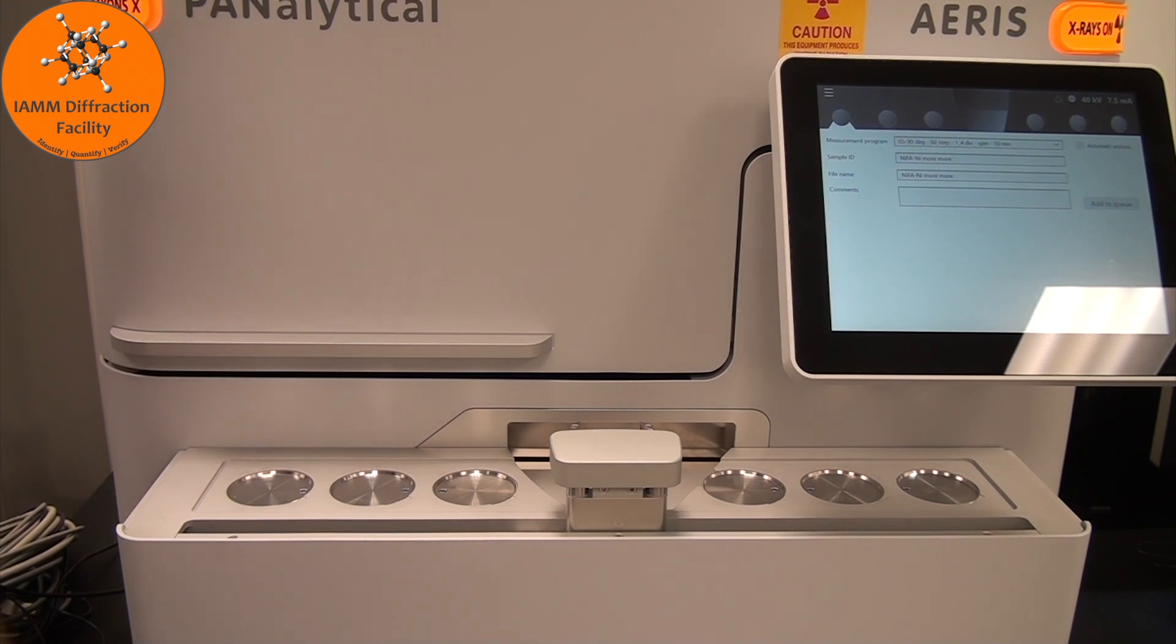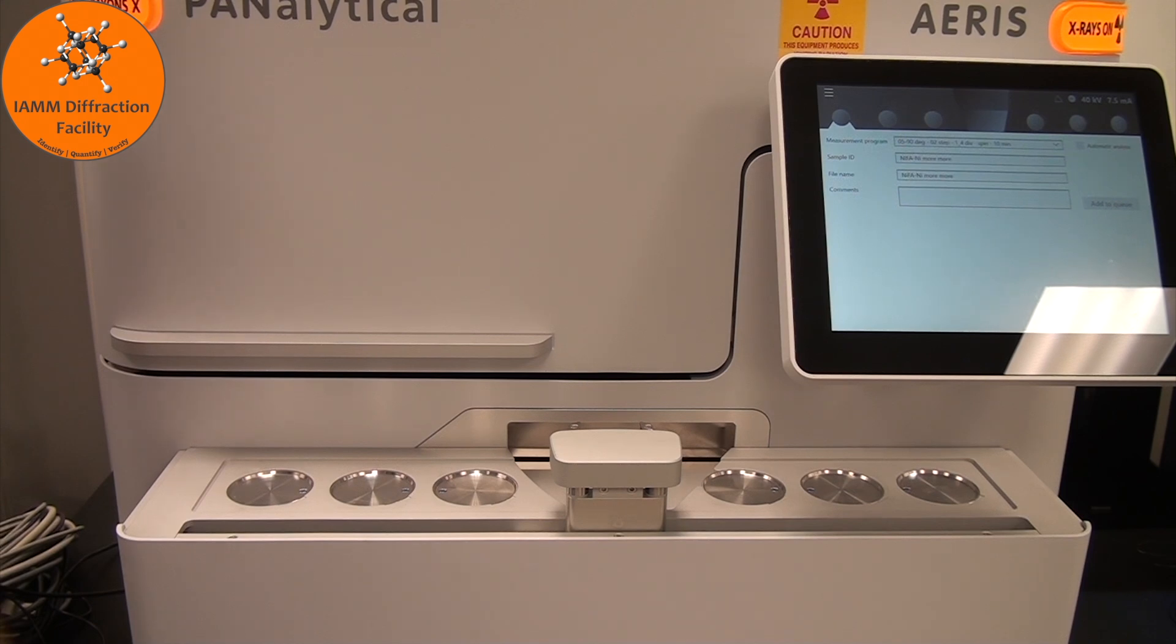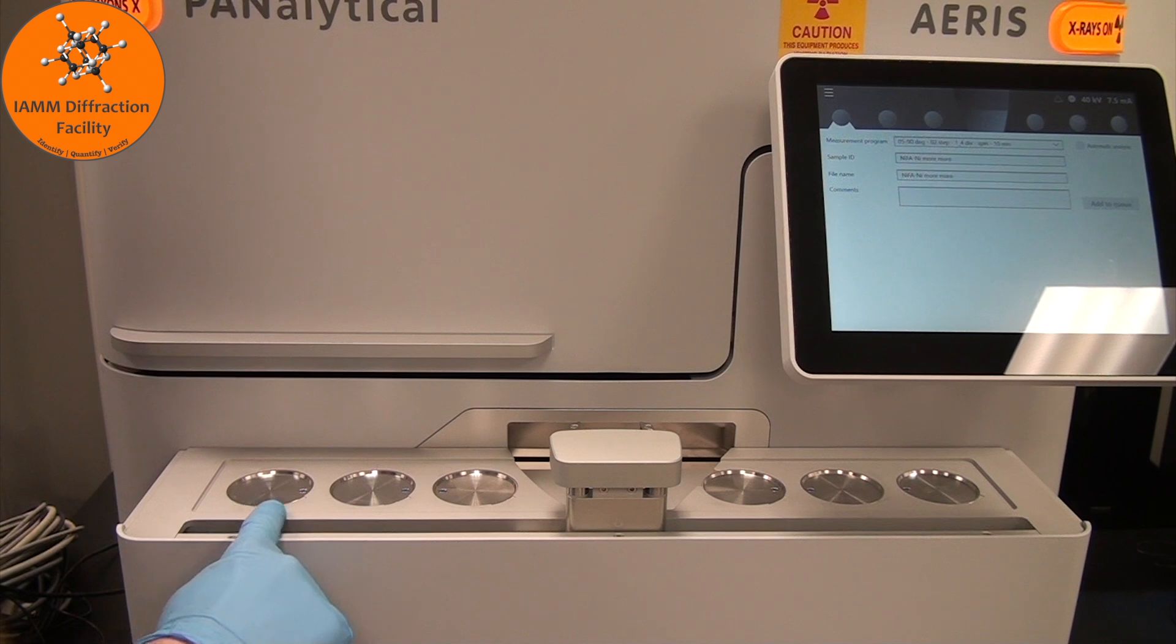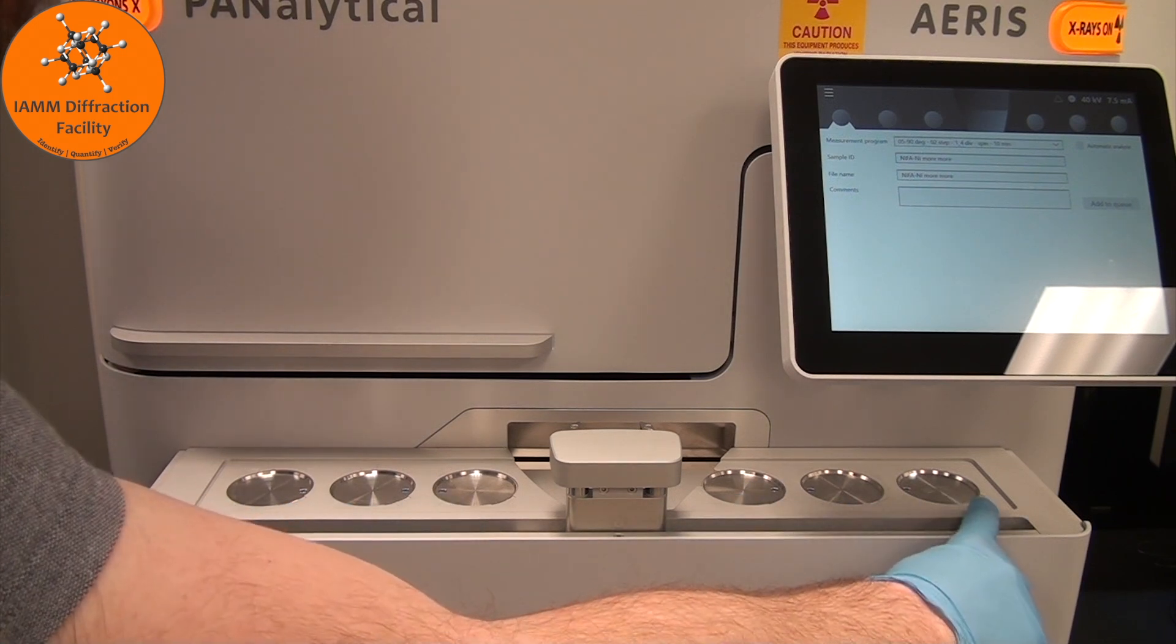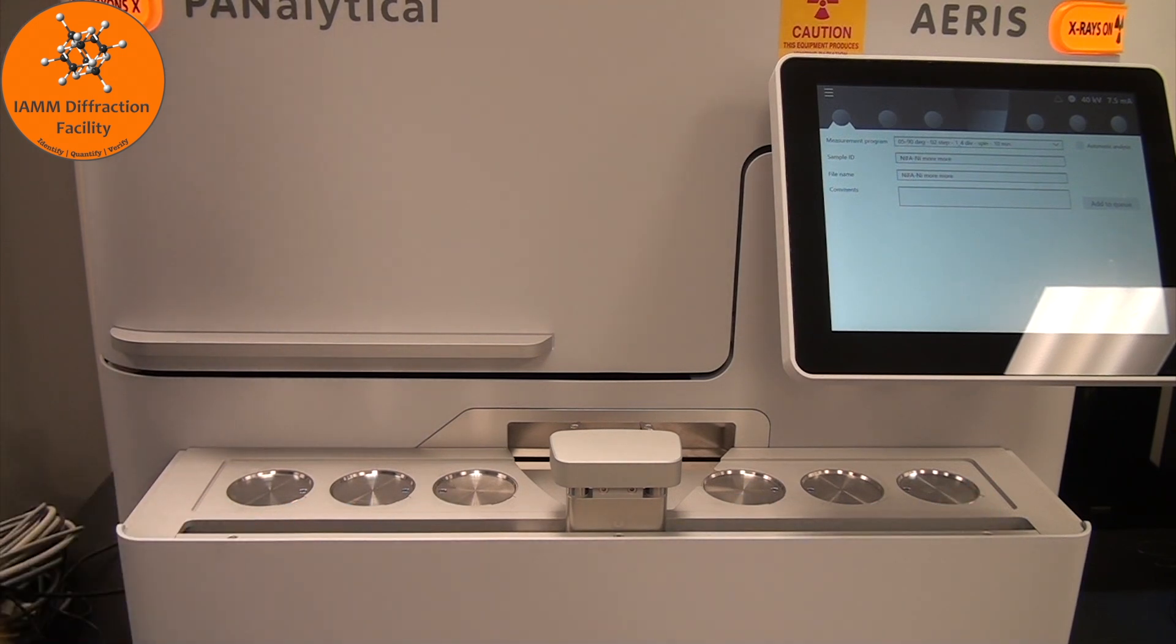Hello all! This video will show you how to use the Aris Diffractometer made by Malvern Panalytical. You'll notice that there are three spots here for samples and three spots here for samples.